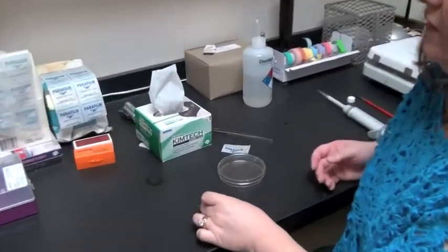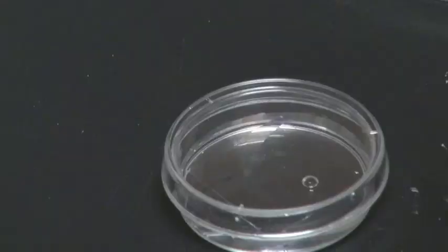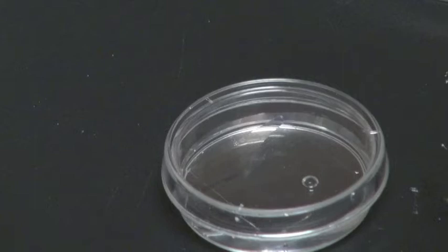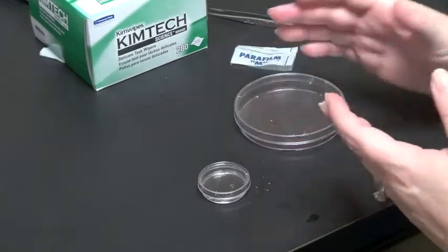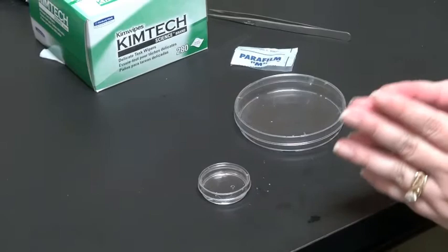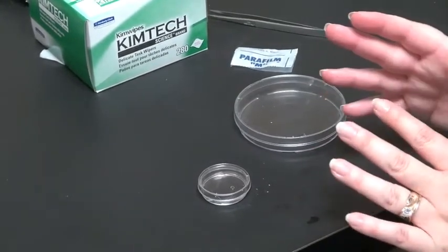I have cells here that I've grown on a cover slip in a Petri dish. I've done all of my washing steps in preparation for my staining, and now I'm ready to do my staining or my antibody application. In order to use as little reagent as possible — antibody or stain — I'm going to construct a humid chamber.